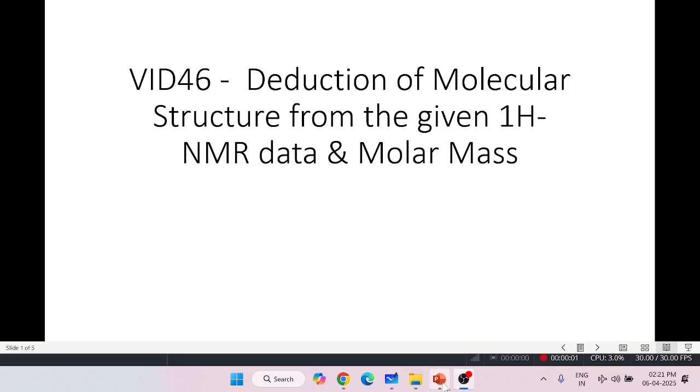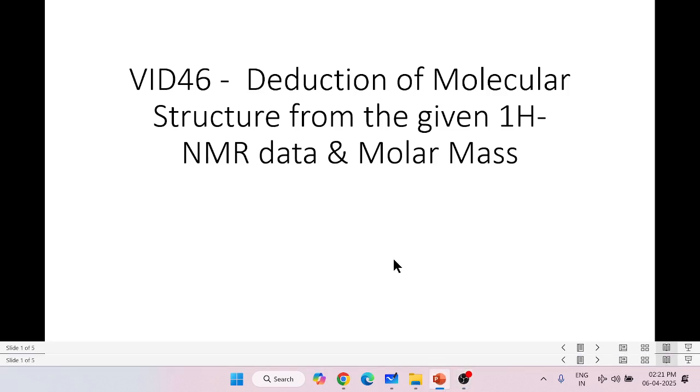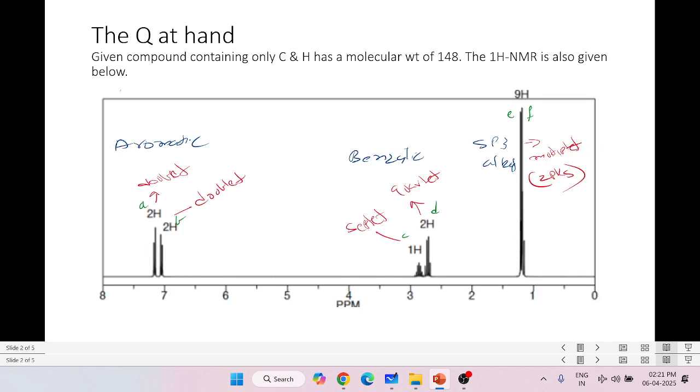Hello students, in this video I am going to talk to you about deduction of a molecular structure from the given proton NMR data and molar mass. So the question at hand: we have been given a compound that contains only carbon and hydrogen, so it's a hydrocarbon. It has a molar mass of 148 and the 1H NMR is also given below.